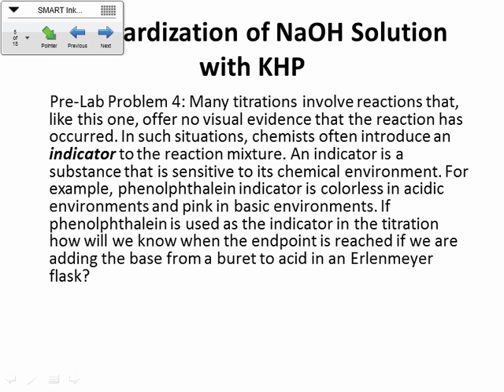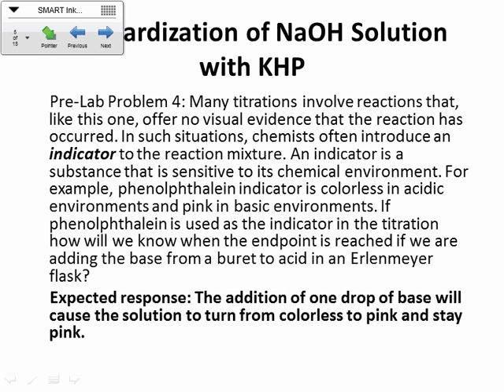So if phenolphthalein is used, how will we know when the endpoint is reached if we're adding the base to the acid? What's going to happen? Yeah, you're going to get that light pink, right? I'll just PowerPoint answer that one. So some of you are getting annoyed with me today, right? The addition of 1 drop of base will cause the solution to stay pink, okay? Just a very faint pink.